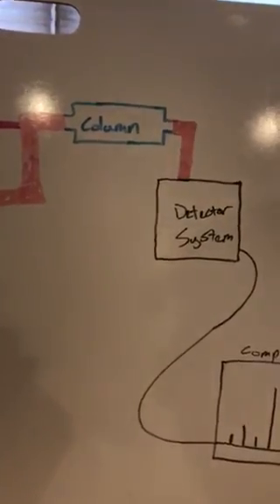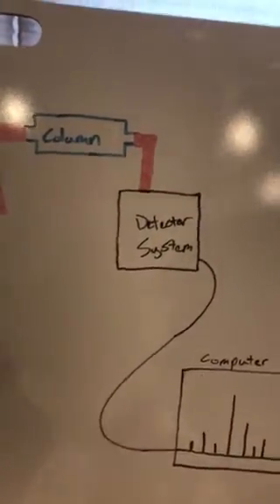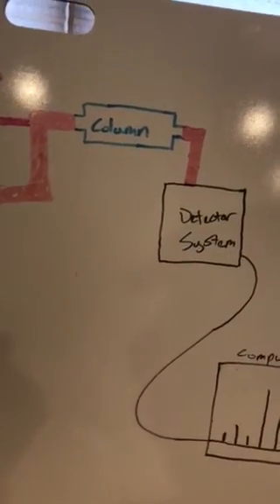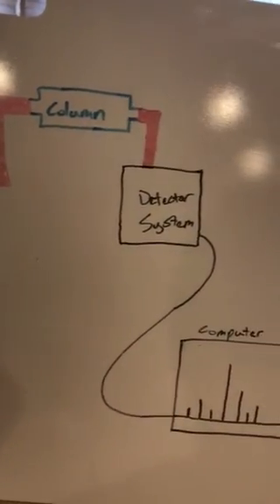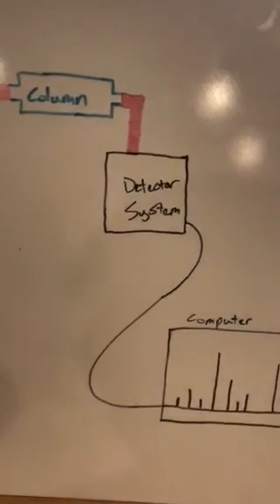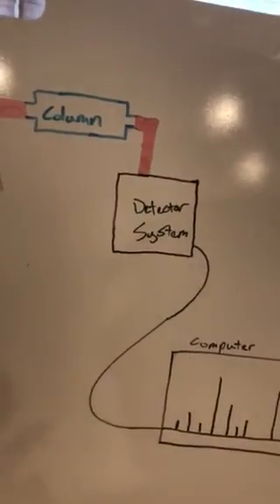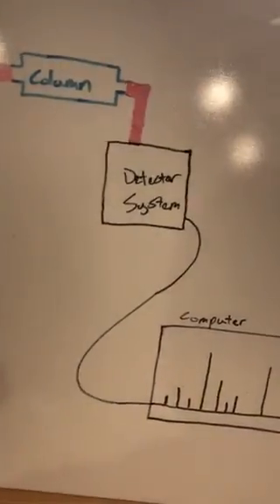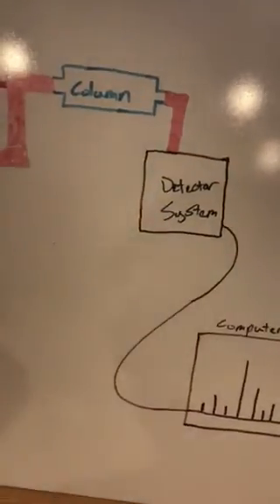One other form of ionization that the MSMS uses is atmospheric pressure chemical ionization. Instead of placing that potential difference across the entire detector, what it does is it places that potential difference across the needle, and when the solvent leaves the needle, it causes something known as corona discharge.